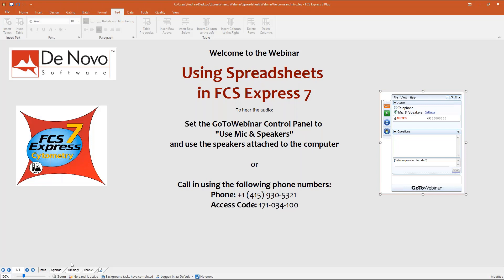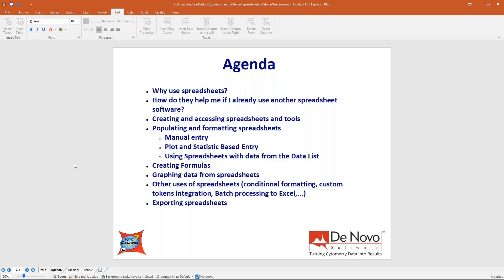Today's agenda: first, why use spreadsheets; then how to use the integrated spreadsheet if you're already using one in another software; then how to create and populate the spreadsheet, create formulas, create charts — a very cool feature. At the end, how to make your spreadsheet more appealing with conditional formatting and other formatting options. And last but not least, how to export the spreadsheet as a whole object or condensed statistics to external formats like Excel or CSV.